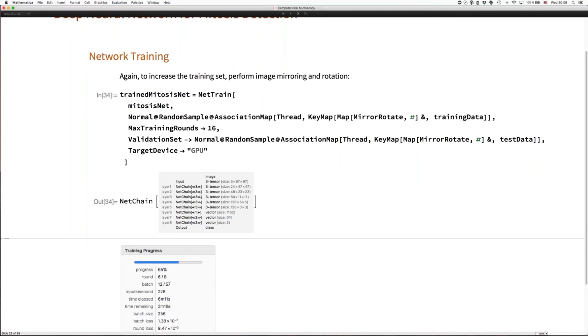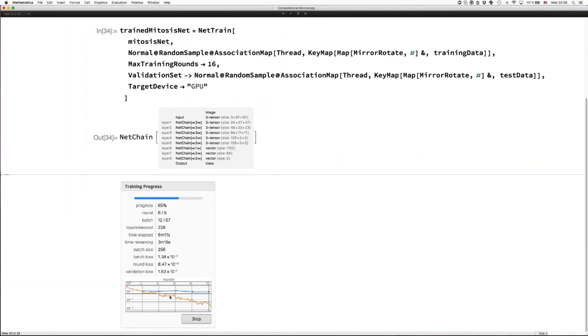And what you saw there, I quickly depict it here, I have frozen this image, is the decay of a loss function. Now, so far you haven't seen a loss function in neural network. Basically, it's just a function, a cost function that tells me, is the neural net working well? Does it produce the output that I want, that I have there as labels? Or does it come up with some output that deviates from the ground truth? And that loss function is basically the red line. We see that the network learns, and becomes better and better in forecasting the label.